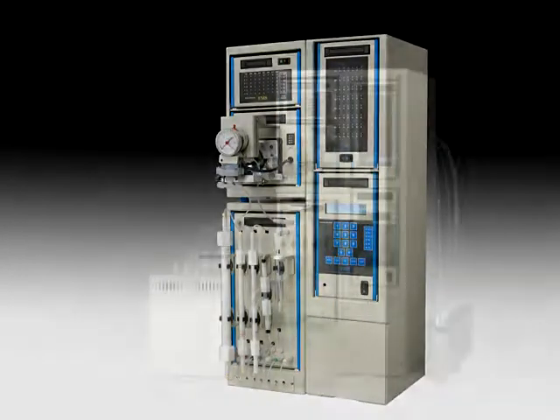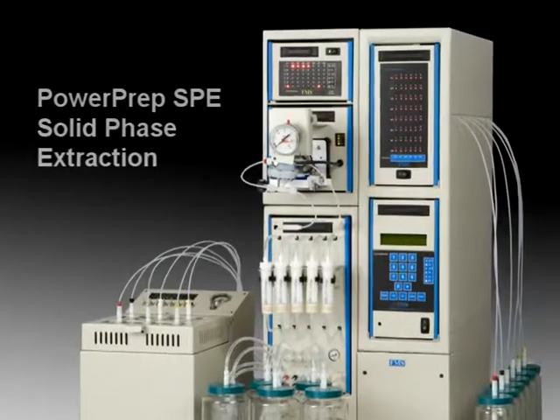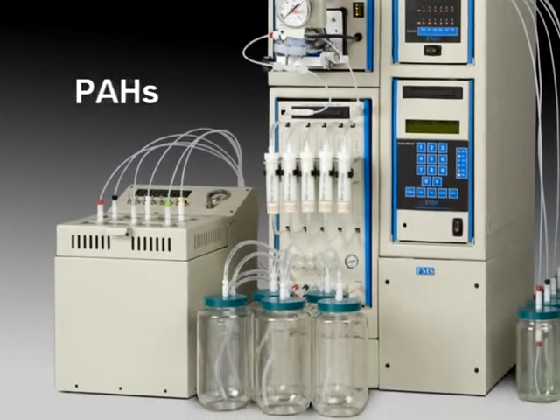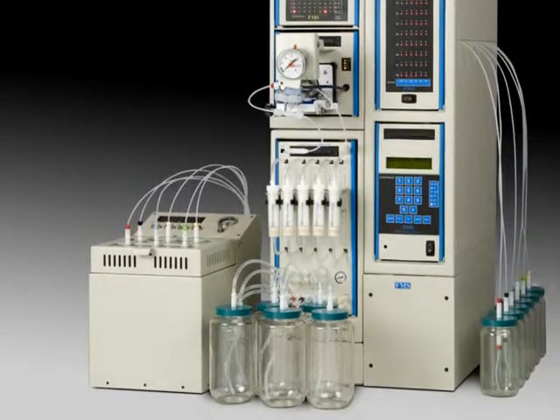The PowerPrep SPE system is a high-speed automated solid-phase extraction system used for isolating analytes of interest from a wide variety of matrices, including urine, blood, water, milk, beverages, soil, and animal tissue.